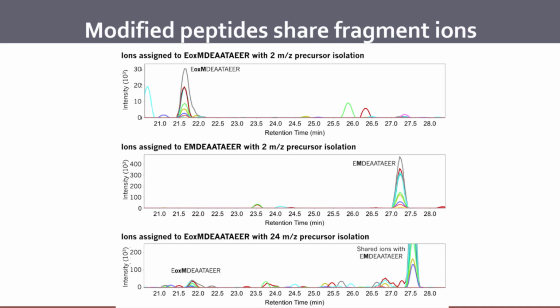The other thing I'll try to make a case for is that our lab has tried for about a decade now to do DIA with windows of less than 4 m/z. The main reason for 4 m/z is that it's the size for which oxidation is always in a different window, and also CH2. Most sequence variants are caused by differences in CH2, so valine to leucine, serine to threonine, aspartic acid to glutamic acid. With a 4 m/z wide window, doubly charged is 7, and triply charged it's 4 and a bit. So it really is those two things.